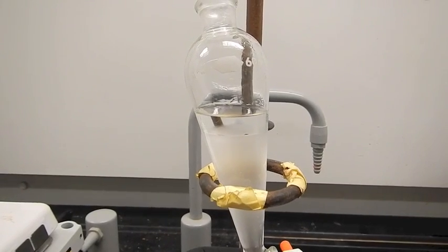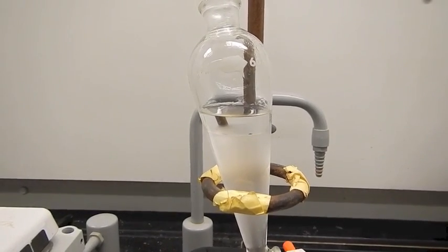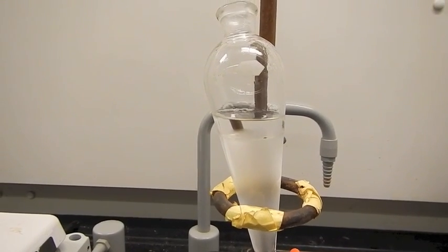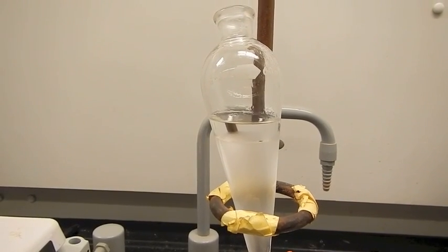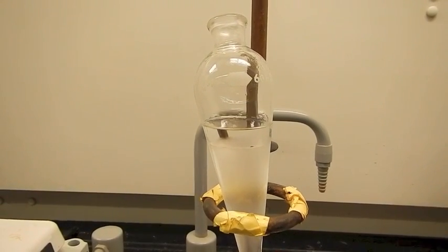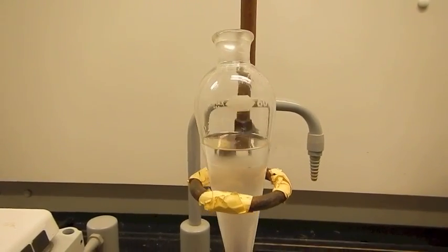So after shaking for 2 to 3 minutes, I've let it settle and I can see 2 distinct layers. The top layer is actually my product and the bottom layer is the aqueous layer. So I want to get ready to do my extraction and wash that product that we formed.